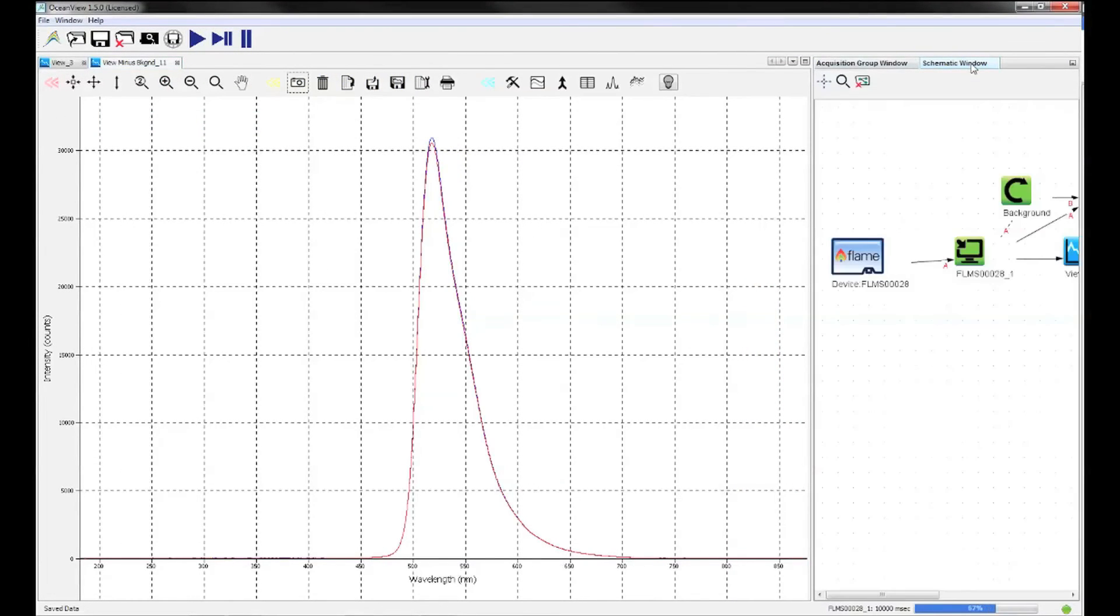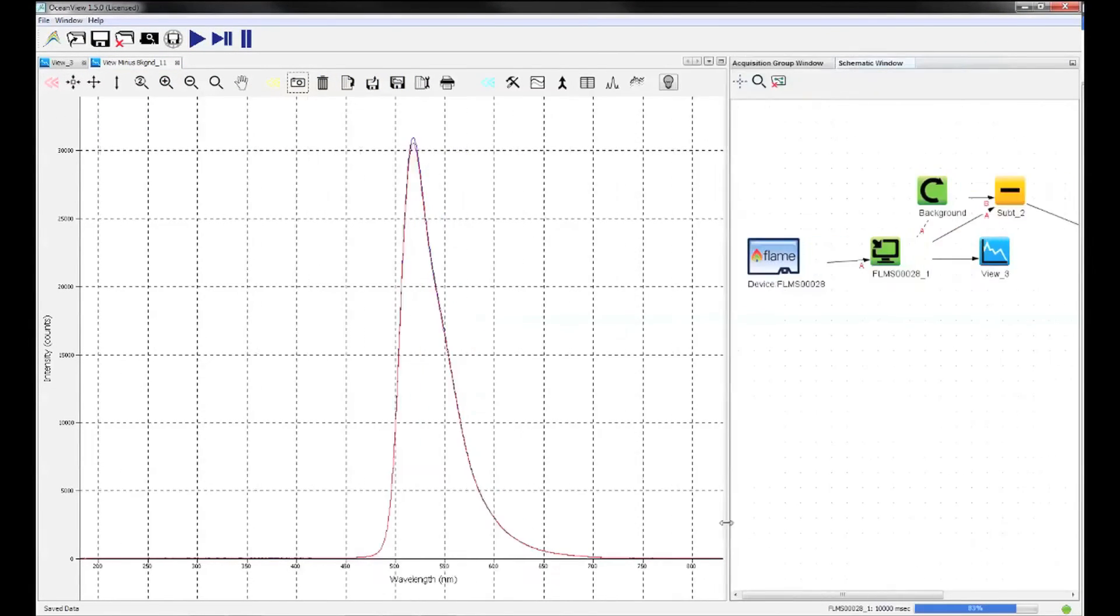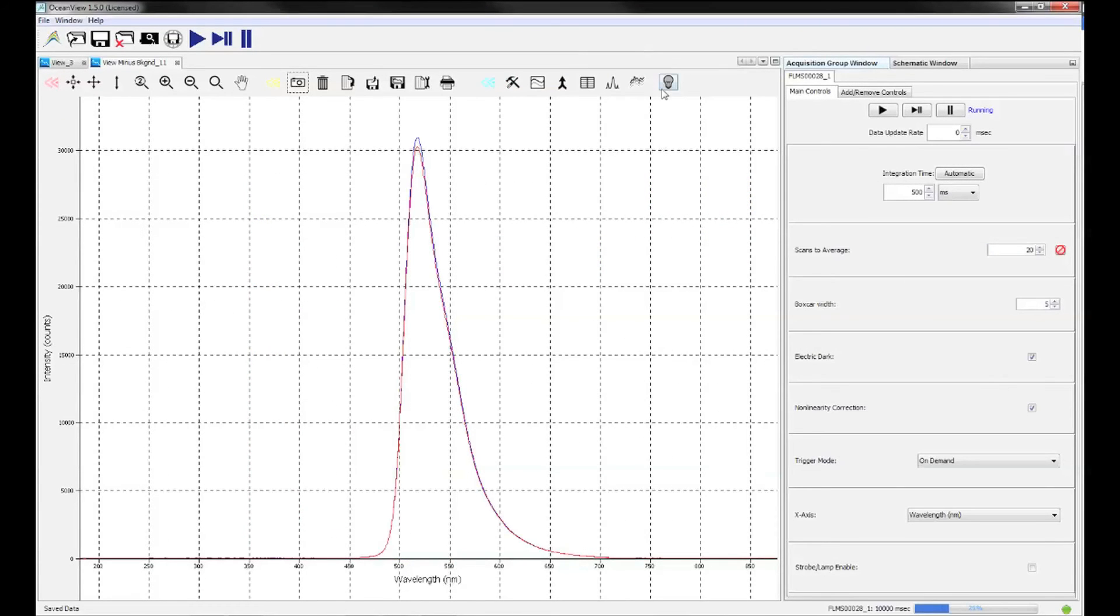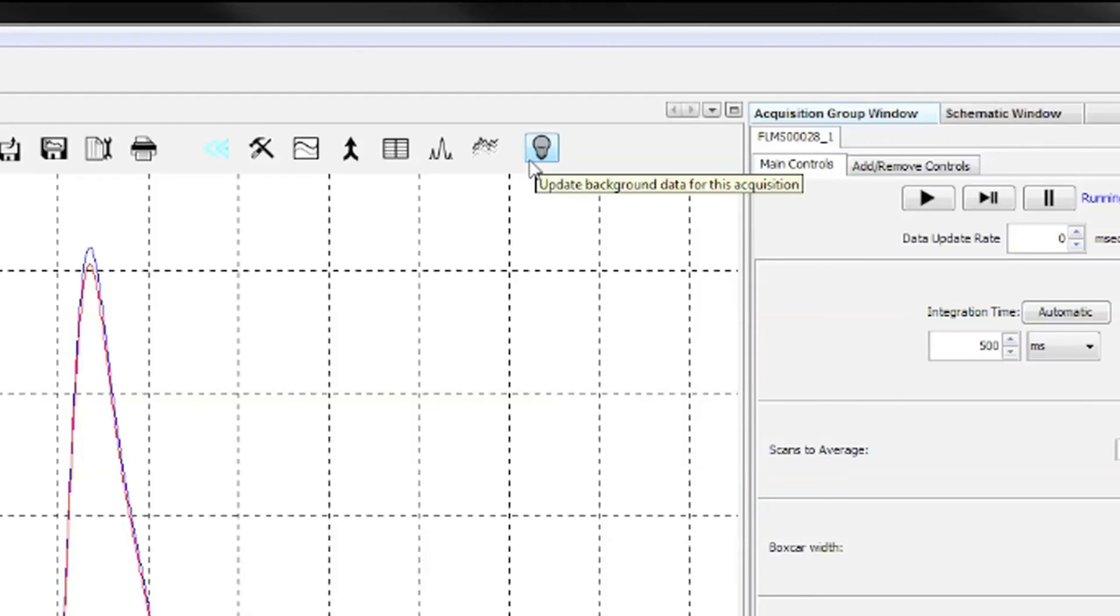You can also look at the schematic window to see the functions that are being performed for your fluorescence measurement. If you want to change the acquisition parameters, make sure you take a new dark using the bulb icon at the top of the screen.